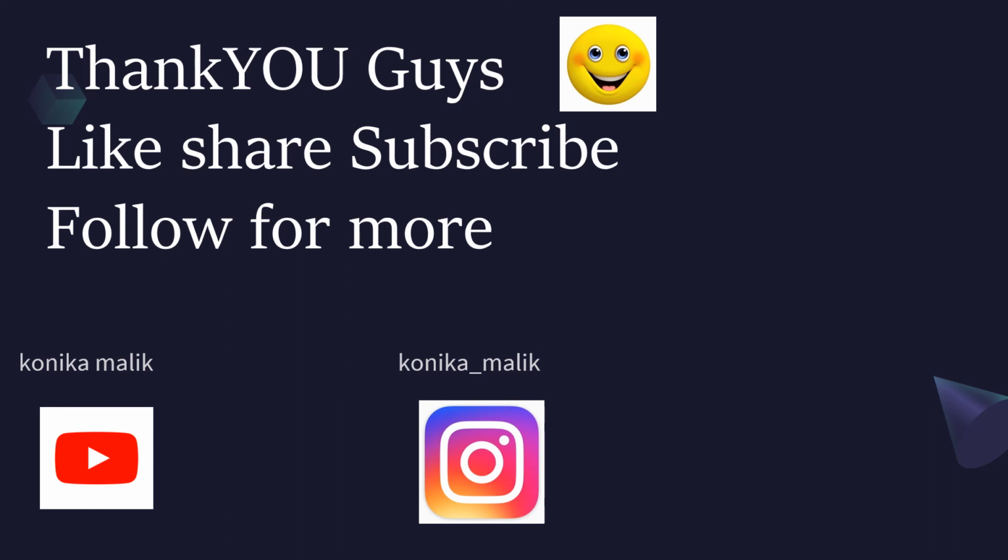Just listen to it one more time. If you are still confused about the working of the microscope, let me know in the comment section. I can make more videos on it. But just remember, our one motto is to make sure the dark background remains and the cells appear bright. And how can we do that? By allowing only cells to get the light and stopping light from passing through the background. And that is the only principle we have used.